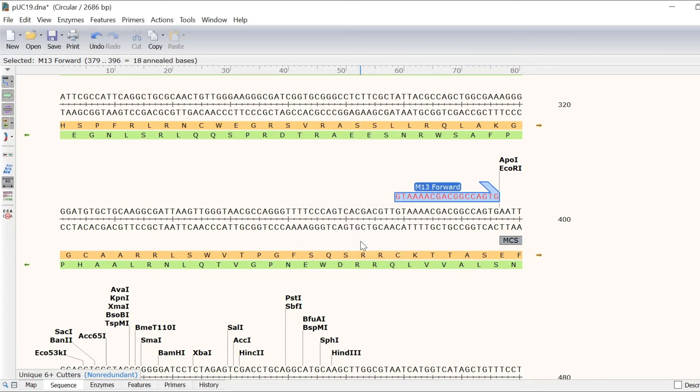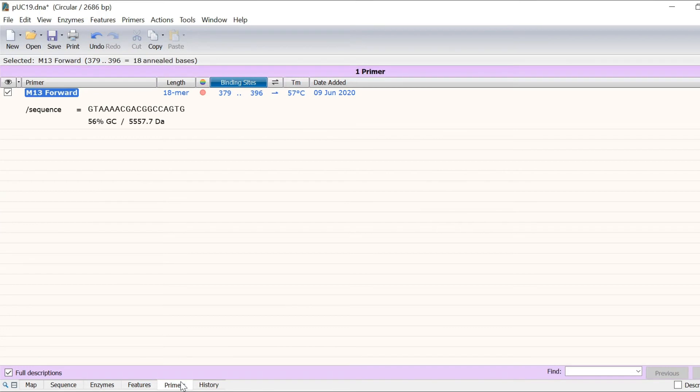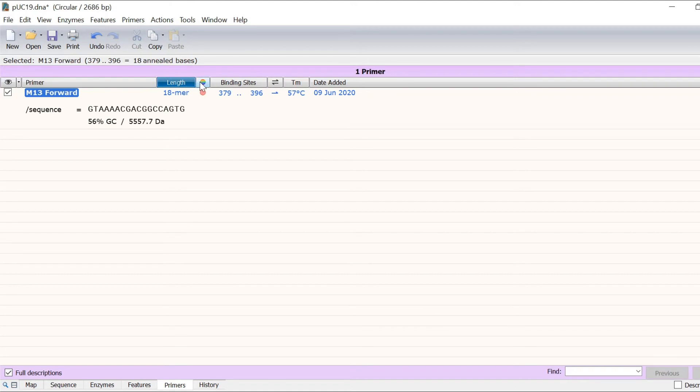To learn more about the primers in the file, head on over to the primers tab. Easily sort the list of hybridising primers by name, length, colour, binding sites, directionality or melting temperature.